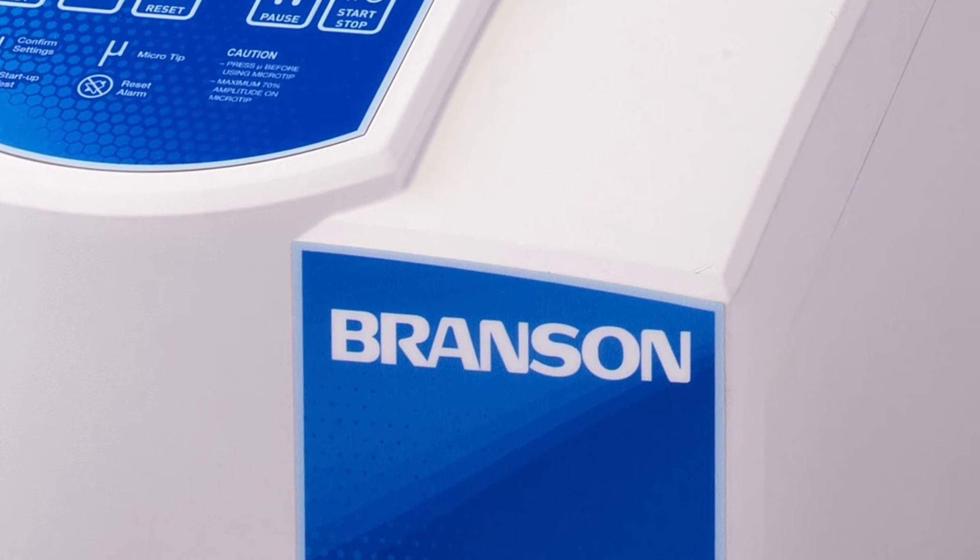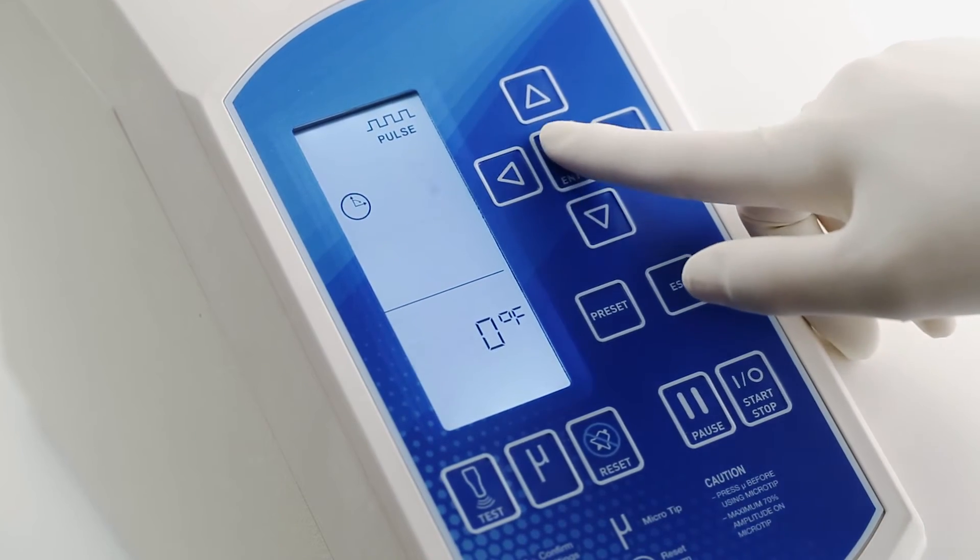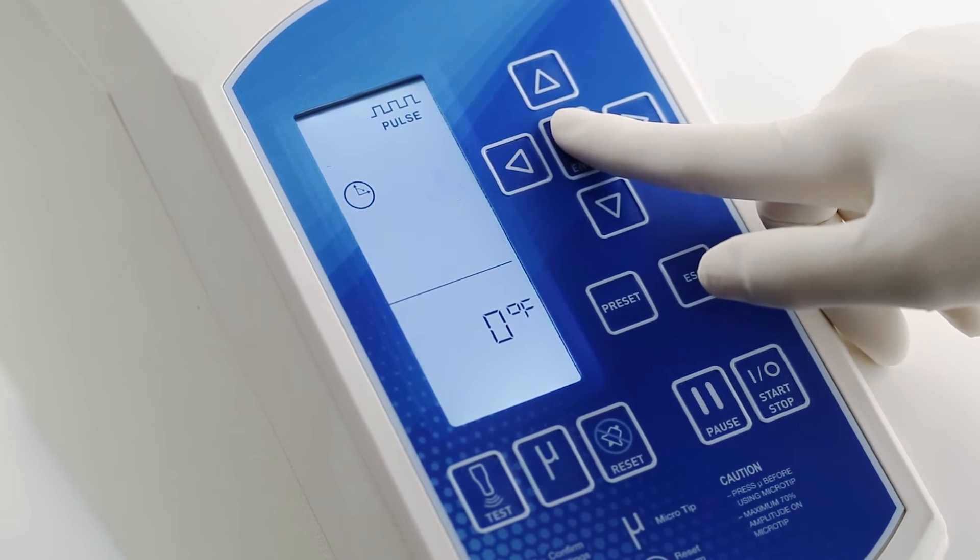And you can specify a temperature range for processing your sample. Once the lower temperature limit is reached, Branson's True Temperature Control automatically modulates the pulse to prevent the sample from exceeding the maximum limit.